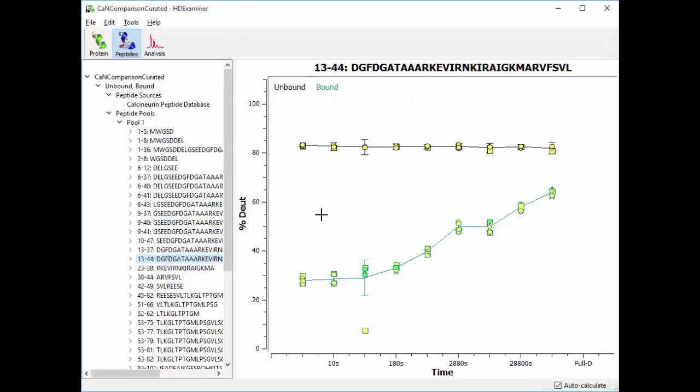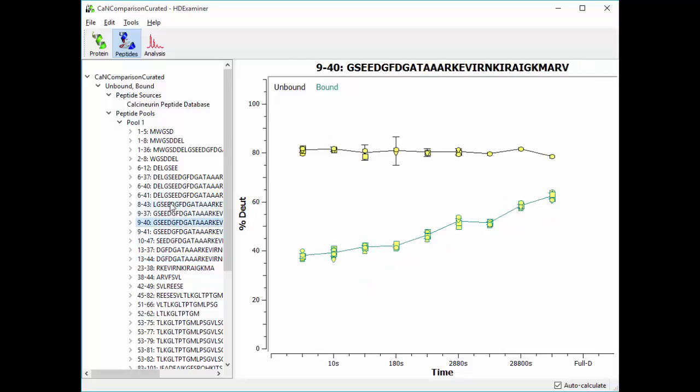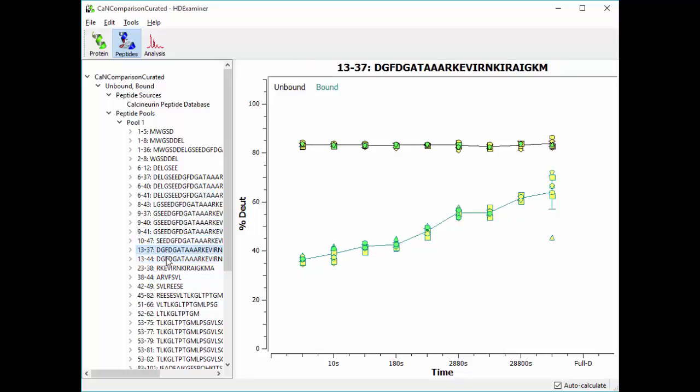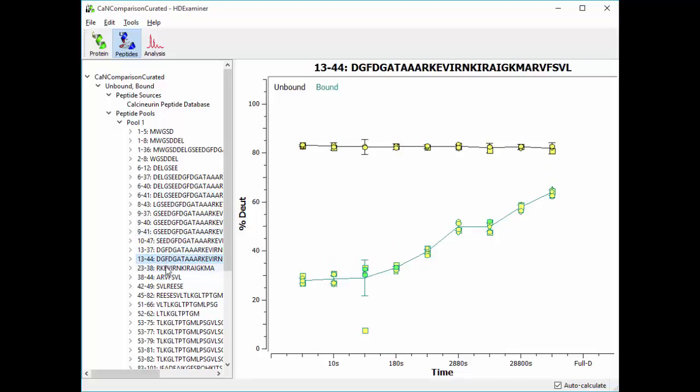So I'm skipping ahead one more time. This is the same project, except now we've curated our data. We've gone through and corrected errors, like I showed you before, by either doing manual overrides, or setting things to low confidence, or in some cases just completely deleting a peptide from the list. So now we have these peptides, all of which have fairly well-behaved uptake plots.